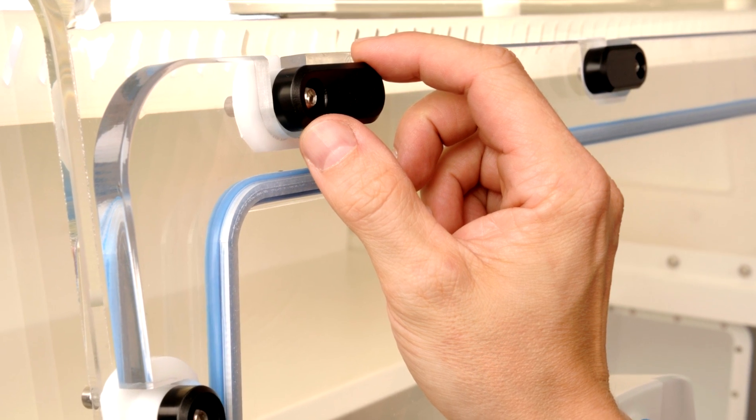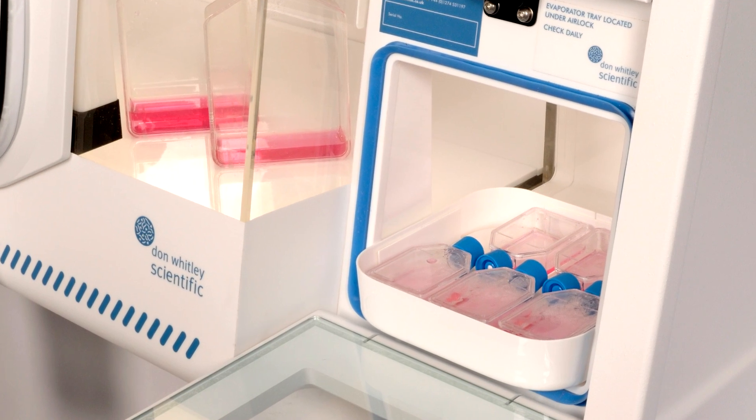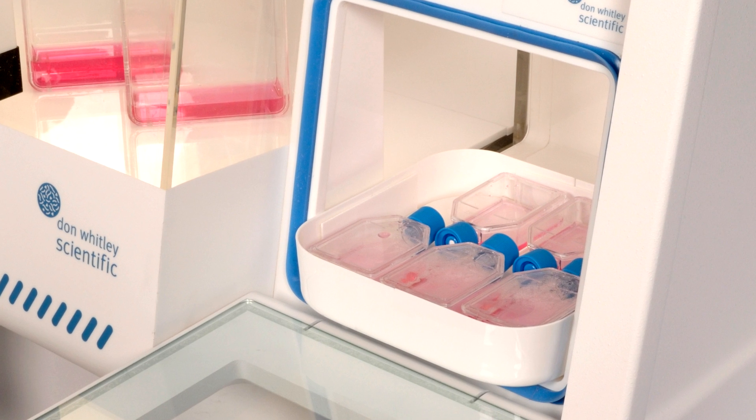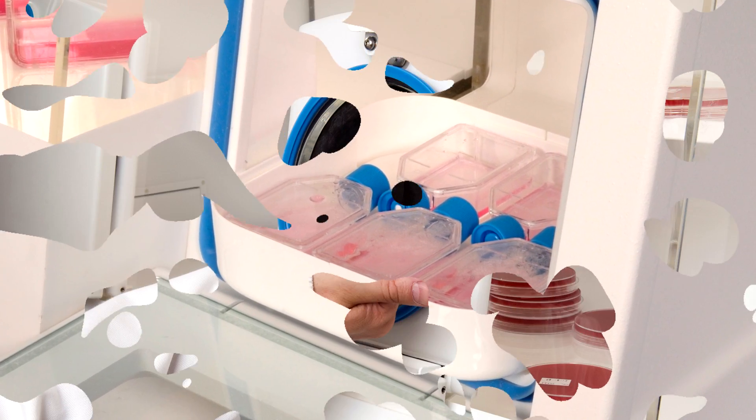The Whitley A35 Anaerobic Workstation is the latest innovation in workstation technology from Don Whitley Scientific. Complete with a built-in rapid airlock and intuitive touch screen control panel, this new workstation allows you to work completely glove and sleeve free.